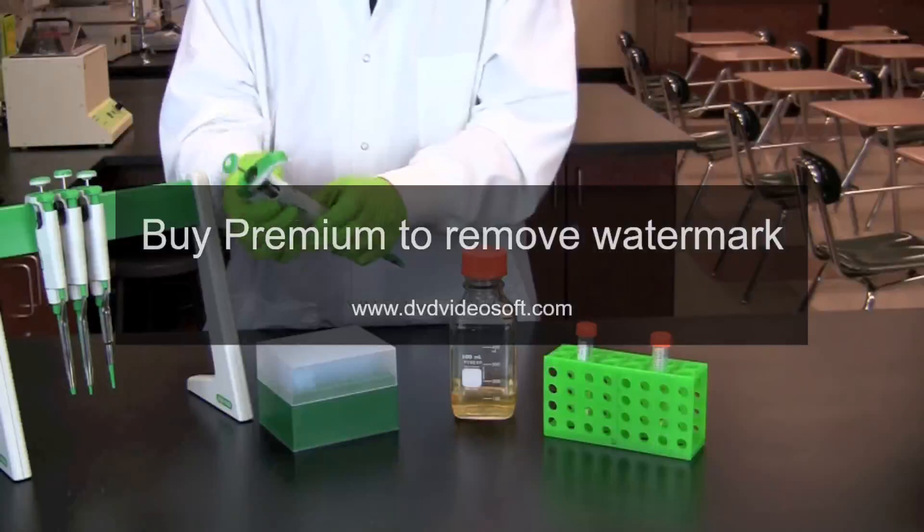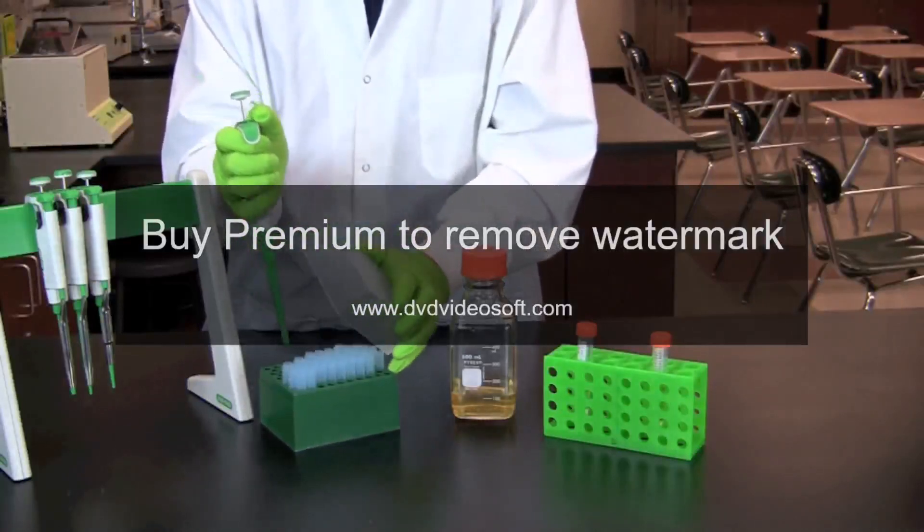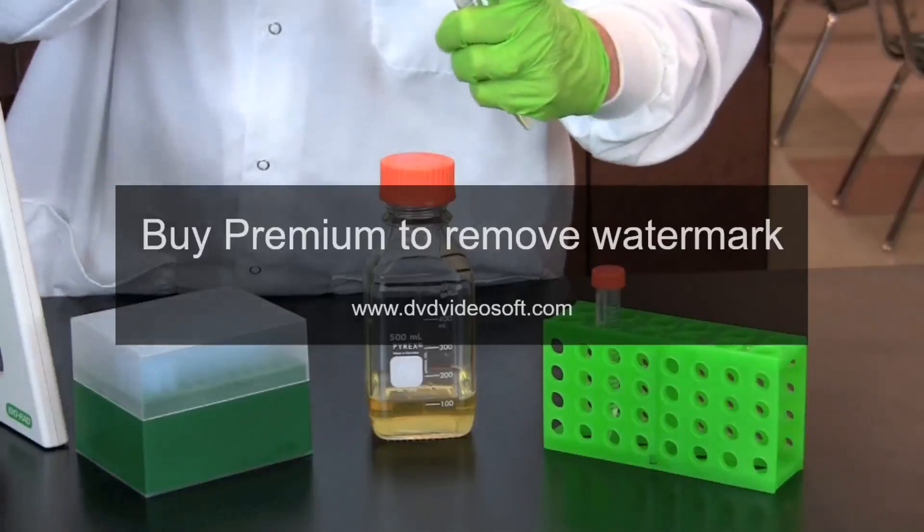Next, reset your pipette to the volume prescribed in your lab protocol and transfer the proper volume of arabinose into your media.